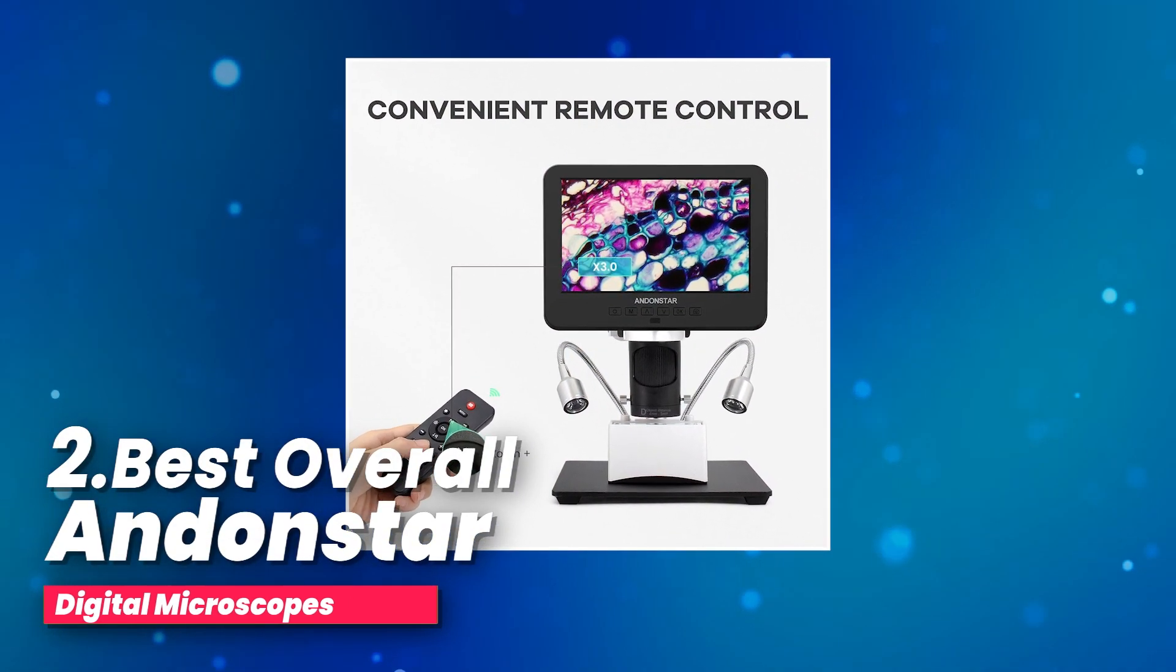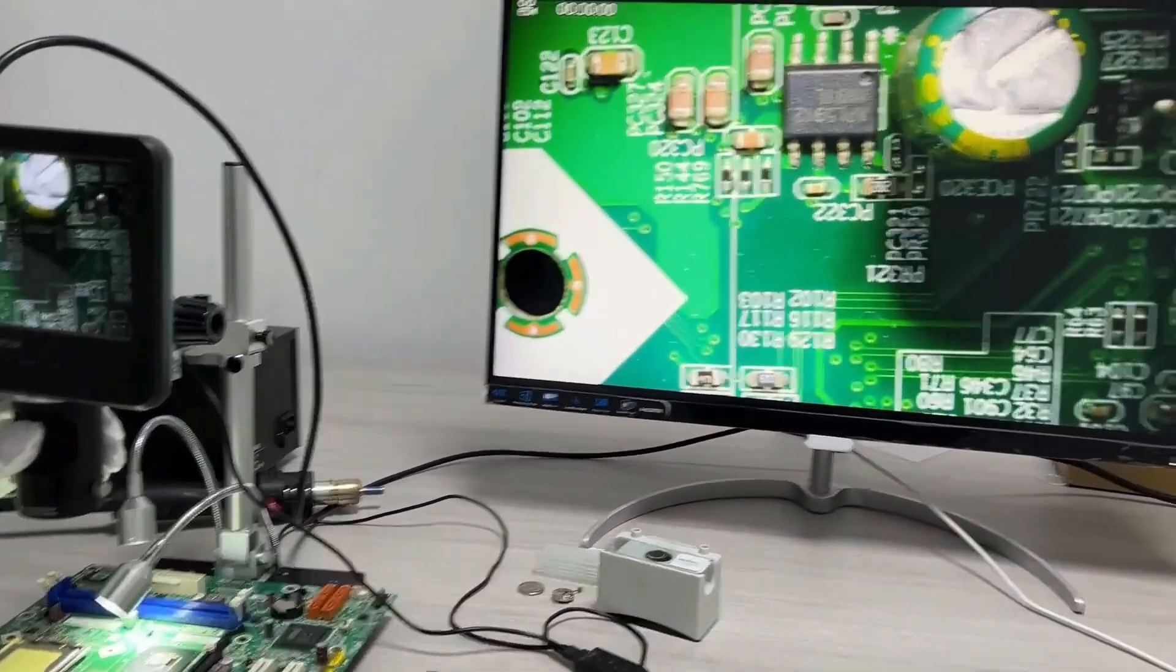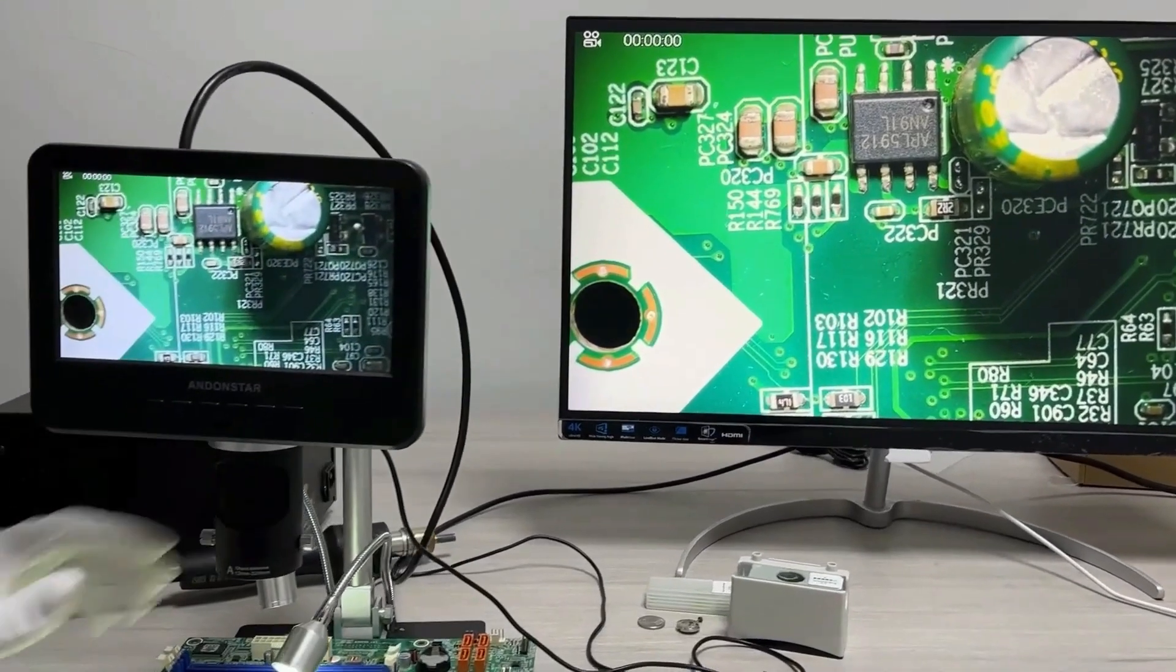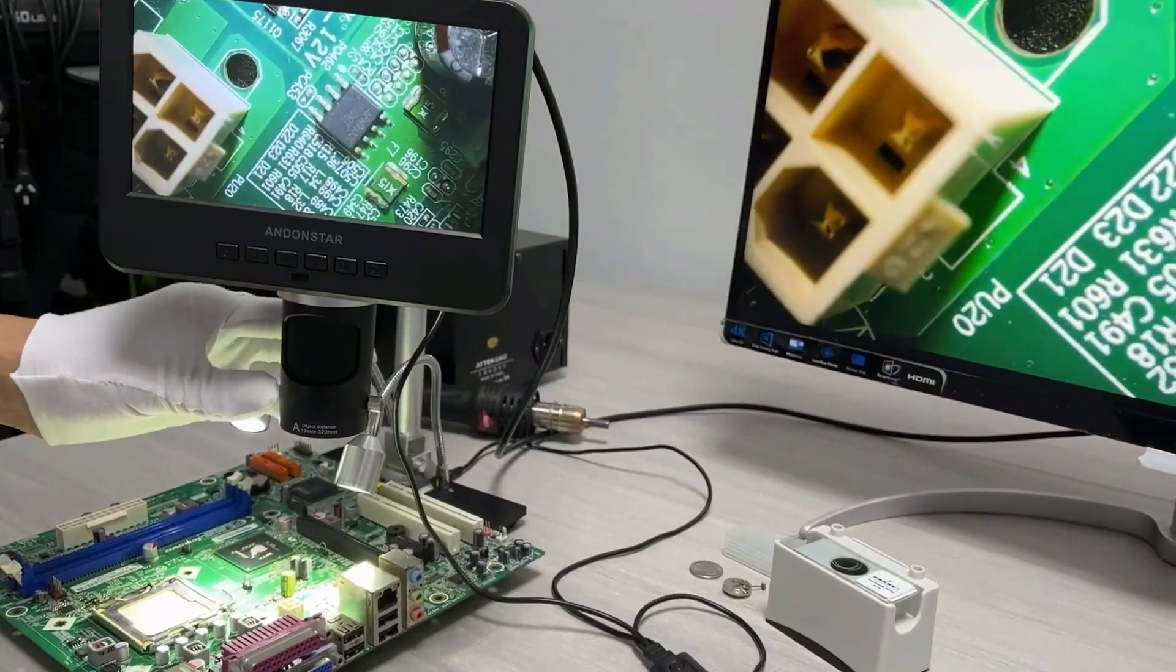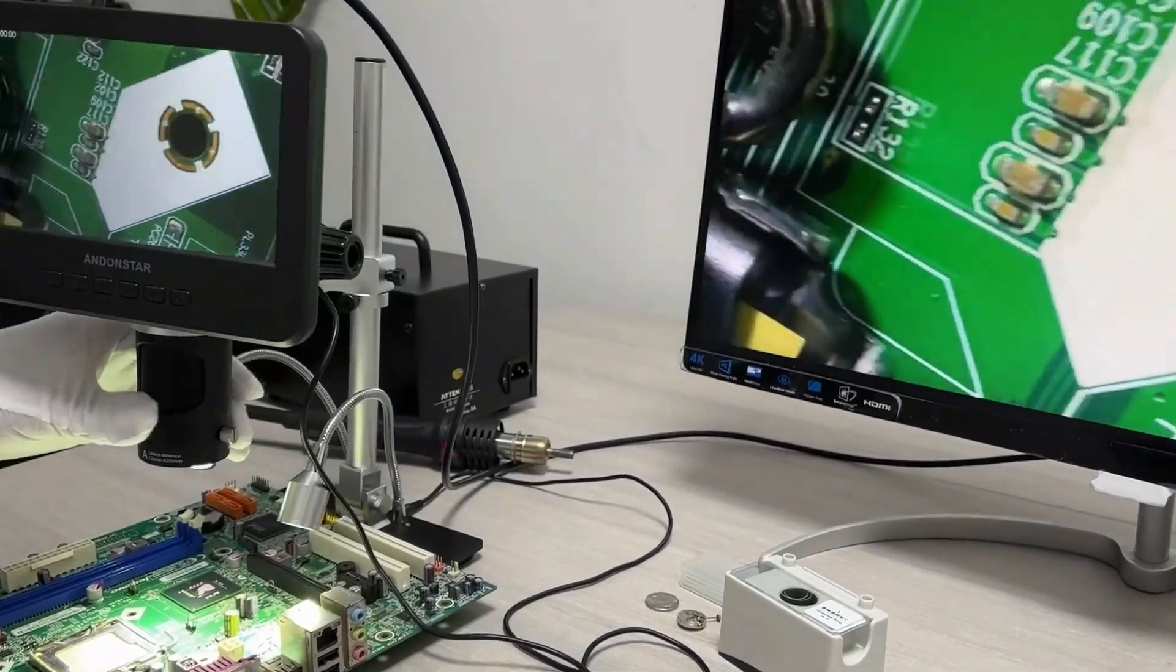Best overall: Andenstar Digital Microscope. Get ready to explore the microscopic world with the Andenstar 3 lens digital microscope. This versatile microscope comes with three different lenses tailored for various tasks.